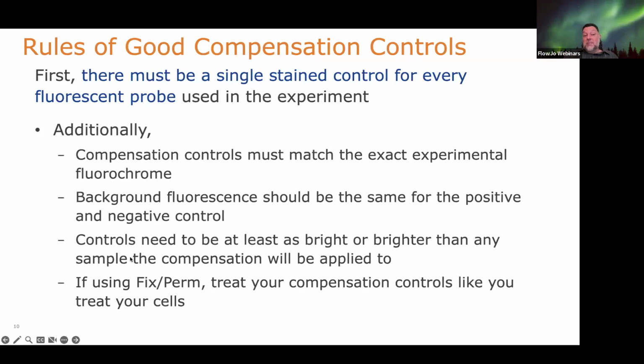For this, I like beads because you can always add a little more antibody to comp beads and it'll push the signal up. The population will go up, up, up. Usually it won't even saturate. You can push it off the scale.